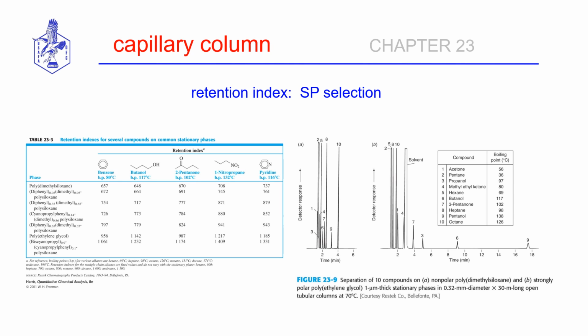So in terms of which stationary phase might work best, let's look at the separation of a mixture of analyte species having the demonstrated boiling point temperatures.